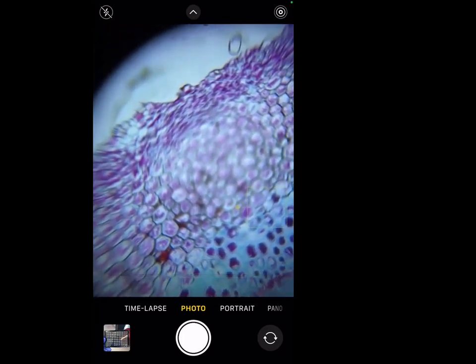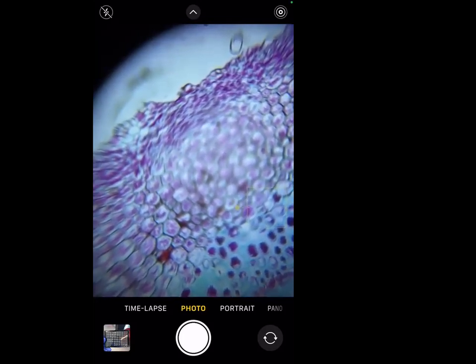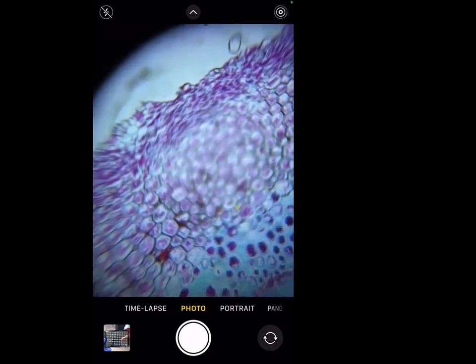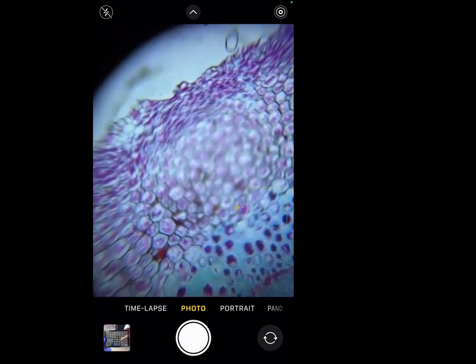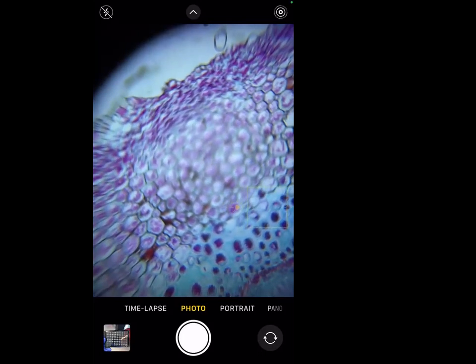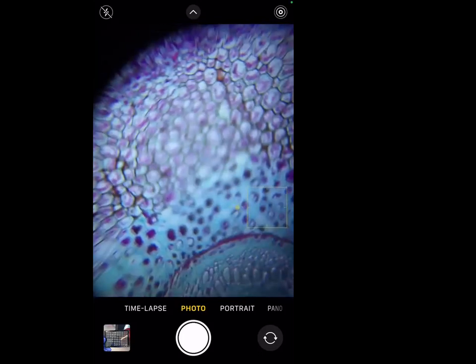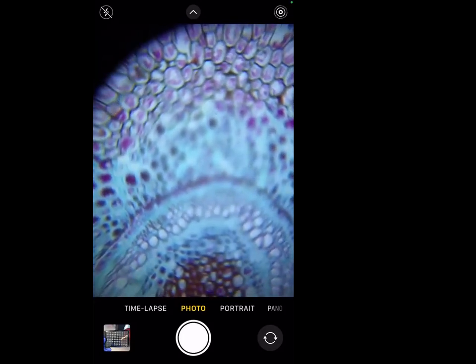And if you take a picture, you can look at the sample later to see how many cells were there, what they look like. So this sample looks amazing because it is stained and then it is preserved well, okay? But I'll show you what real samples look like that you just took out of a pond or whatever. So I'm just moving my foldscope XY.